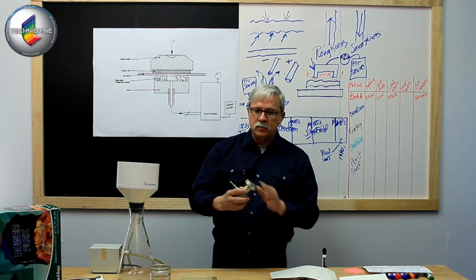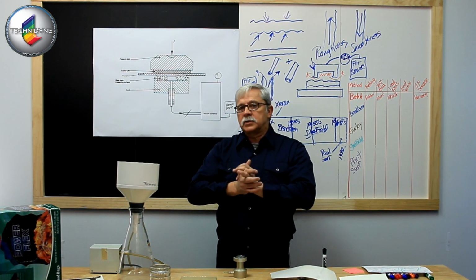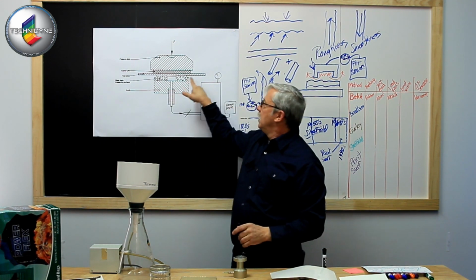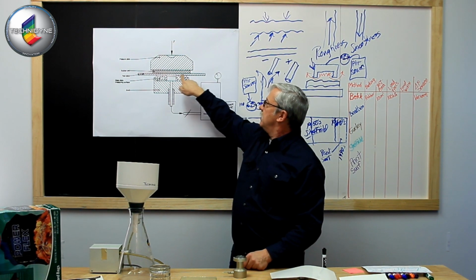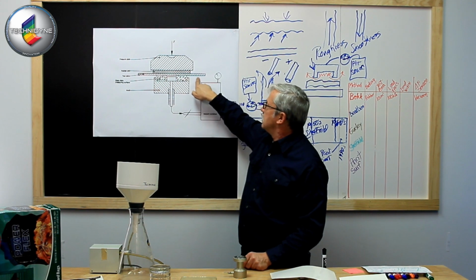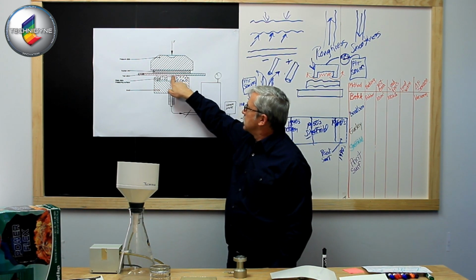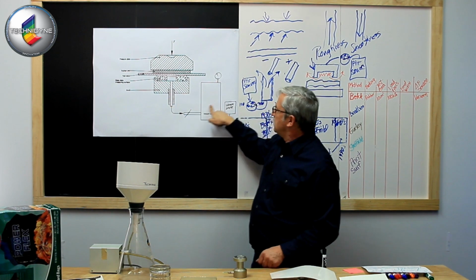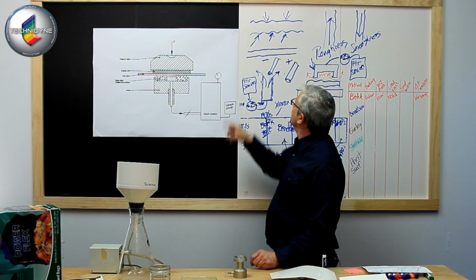When I put this sandwich together, if I'm not clamping it with all the force in the universe, I'm going to create a scenario where my air can make a path across the paper surface, through the channel, and into my evacuated cylinder, much like we have in this scenario.